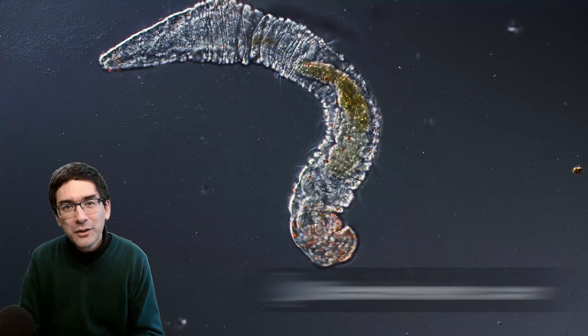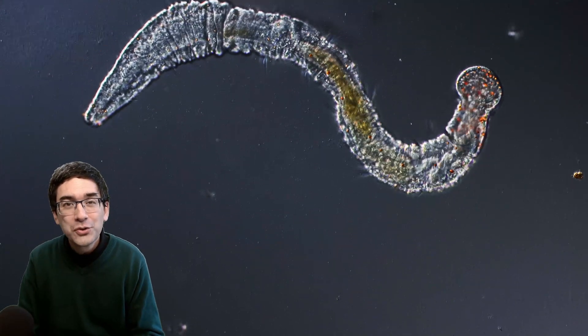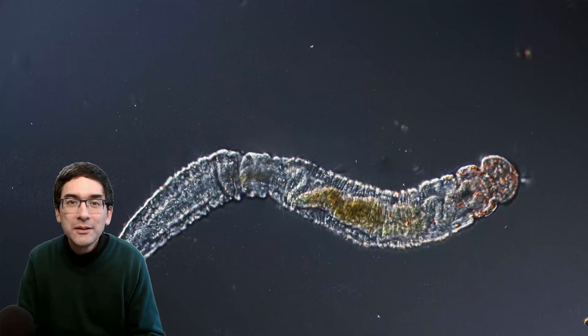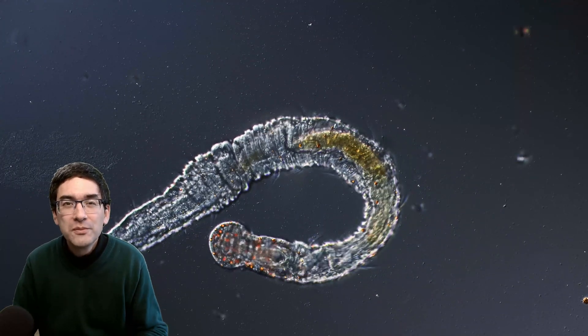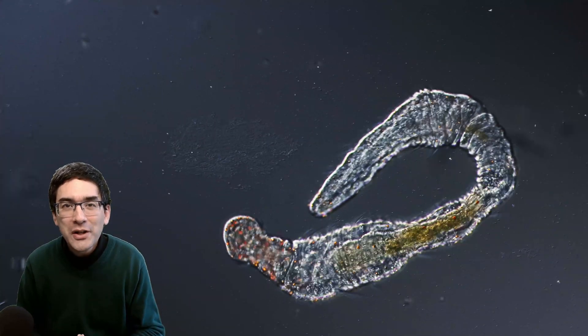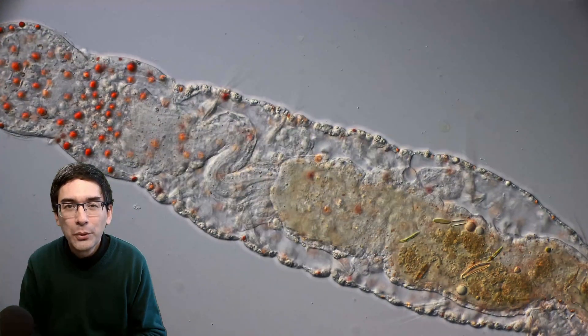In nature you can find a variety of different types of worms, but Iolosoma belongs to the annelids—the segmented worms. If you look very carefully, you can see that the worm is not smooth on the outside but divided into segments, and it also has bristles. Bristles are the little hairs standing out on the side of the body.